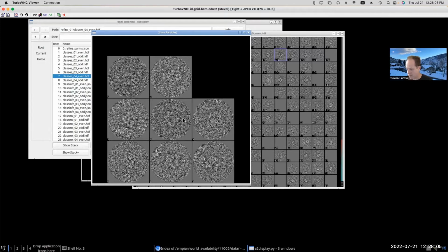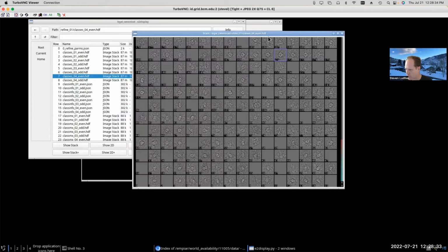That's fine, it's the same information, but it means that if you wanted to extract this metadata about which particles went into this class average, you'd then have to go back through the database, which might have 1 million particles in it, and search every one of those 1 million particles to find the ones which were members of this class. So a little bit of programming effort and a little bit of time would be involved in doing that. It's very convenient if you can actually store the information about the classification associated with the particle itself.